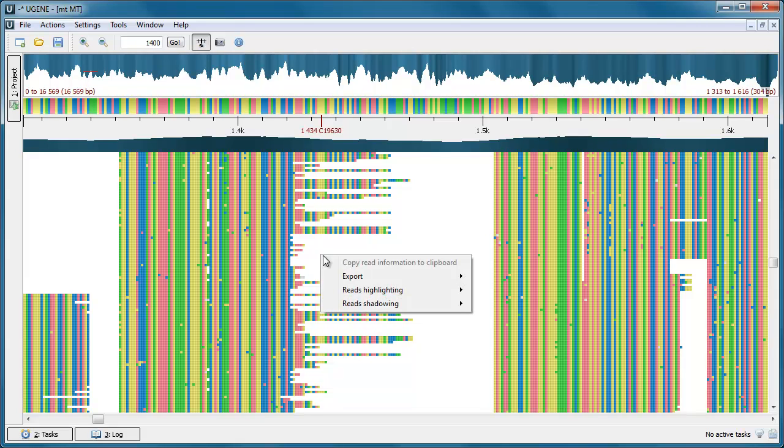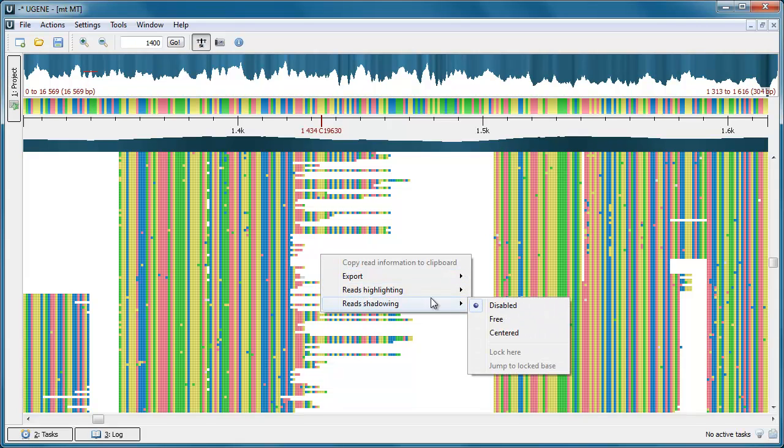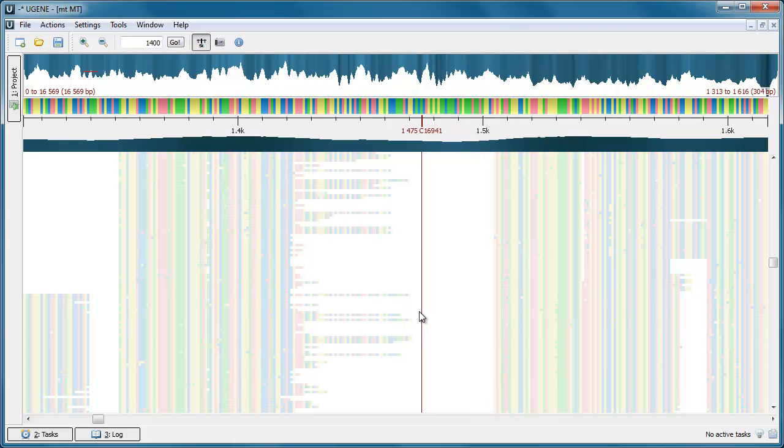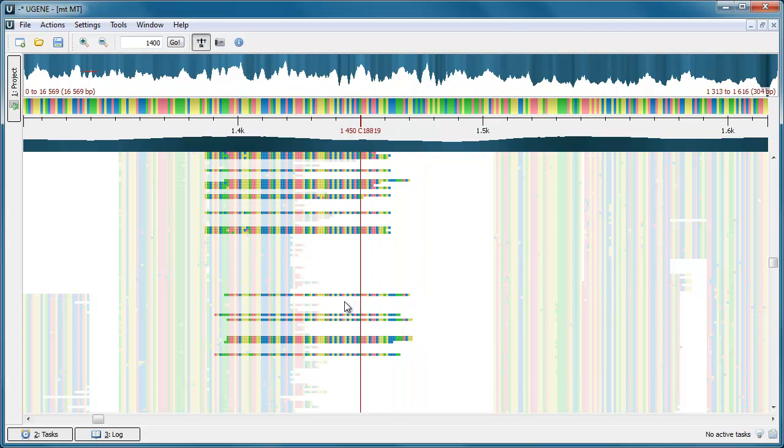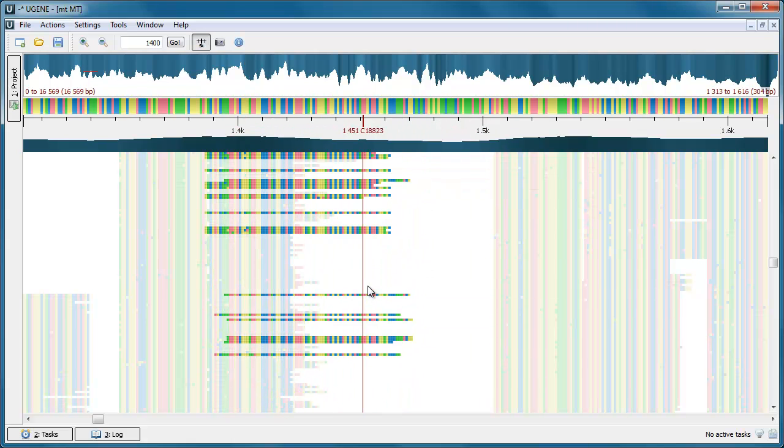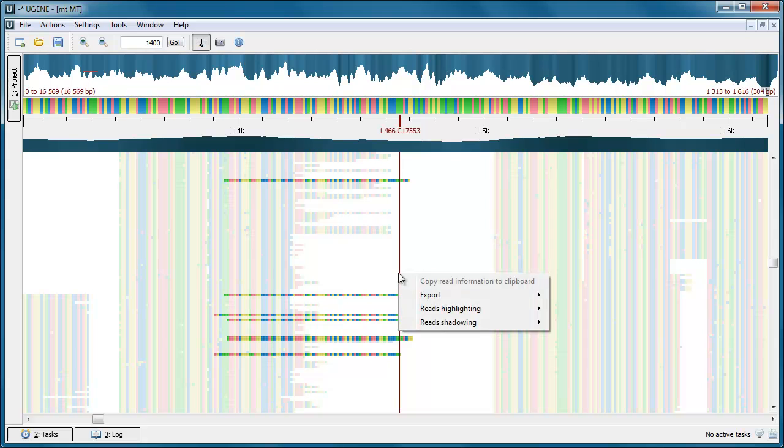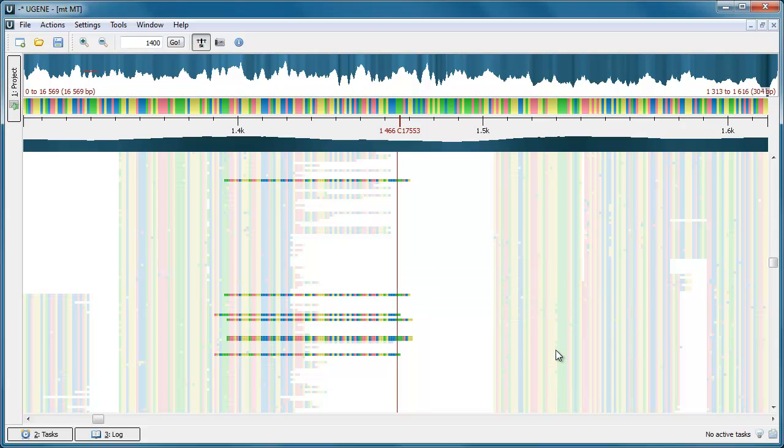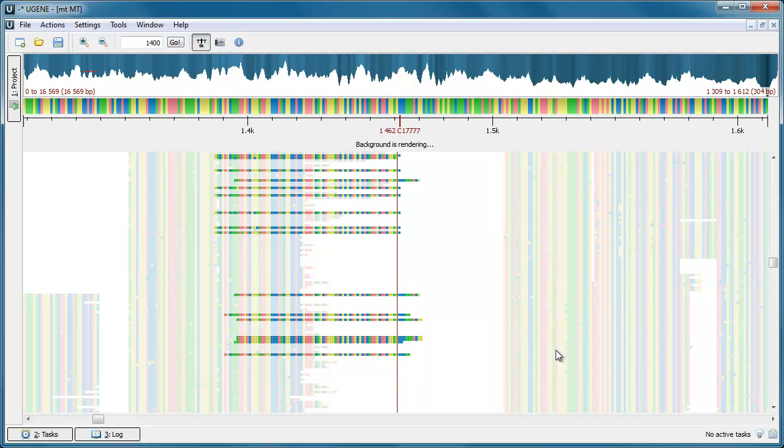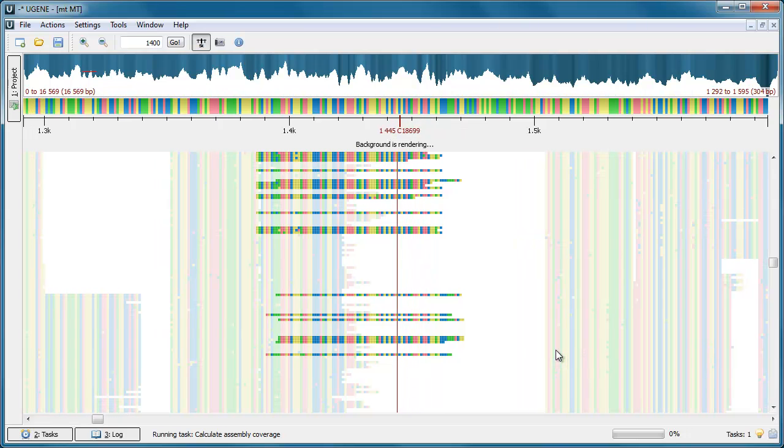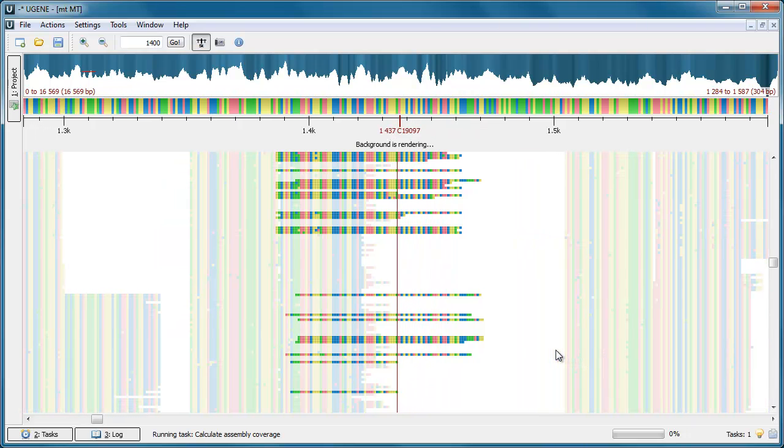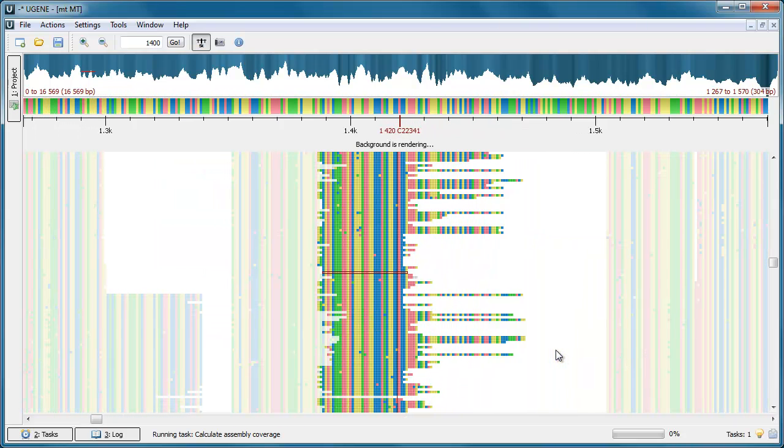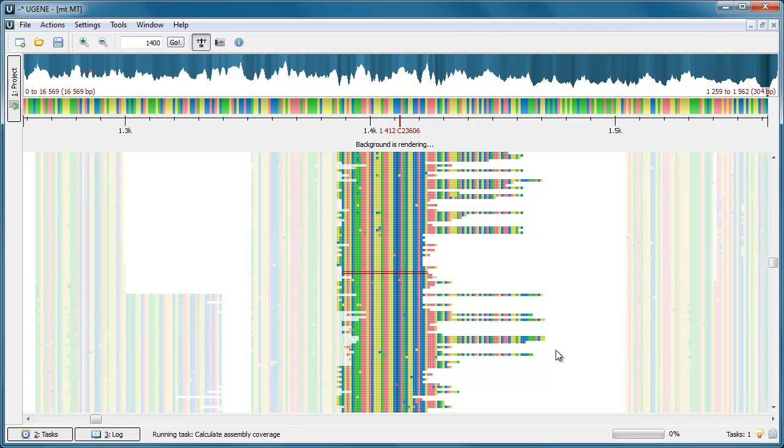Several reads shadowing modes appeared in UGENE 1.10. The Free shadowing mode highlights all reads that intersect a given column. The Centered shadowing mode highlights all reads that intersect the column in the center of the screen. Read the assembly browser documentation to learn more about reads highlighting and shadowing modes.